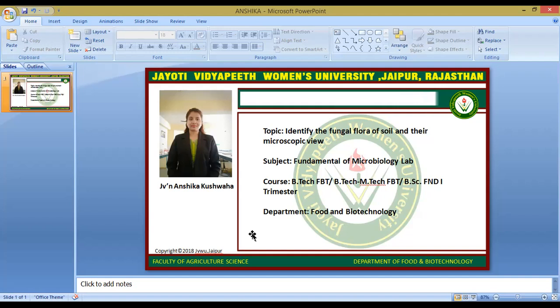We take 10 test tubes and make one stock solution using one gram of soil sample and 9 ml of distilled water. We then take 9 test tubes and transfer 1 ml from each into the next. Then we inoculate the sample into the petri dishes and incubate at 37 degrees Celsius or 28 degrees Celsius.